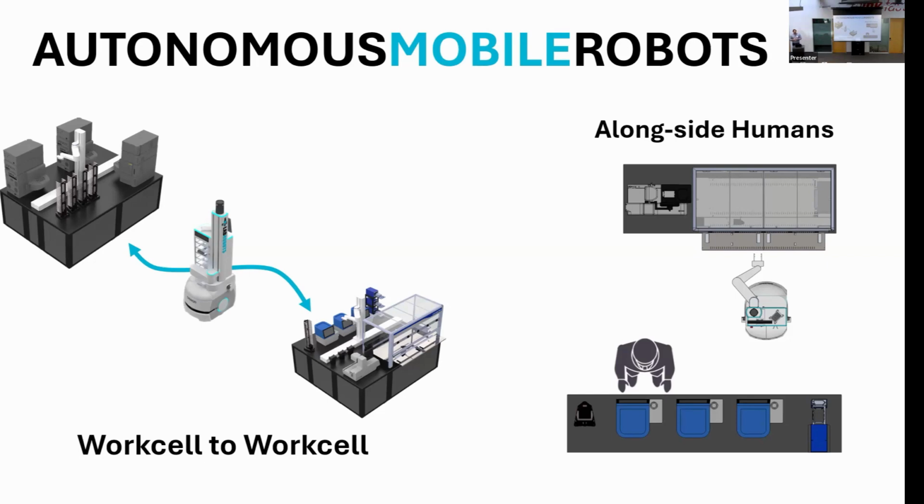The technician could also rely on that AMR to create an on-the-fly workflow to assist them in performing operations such as retrieving samples from storage or prepping certain labware.